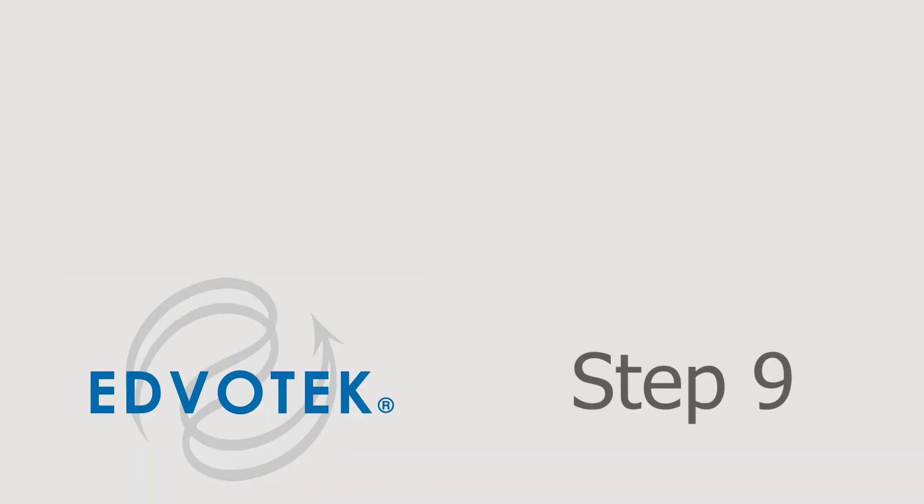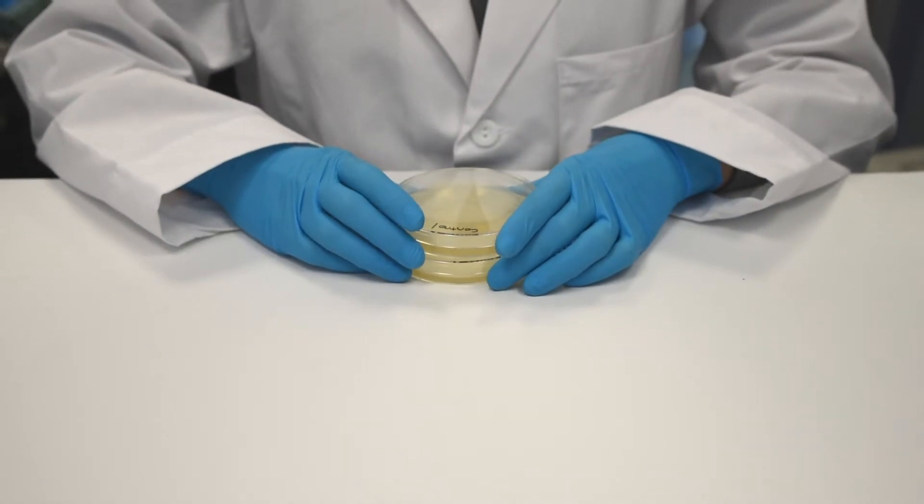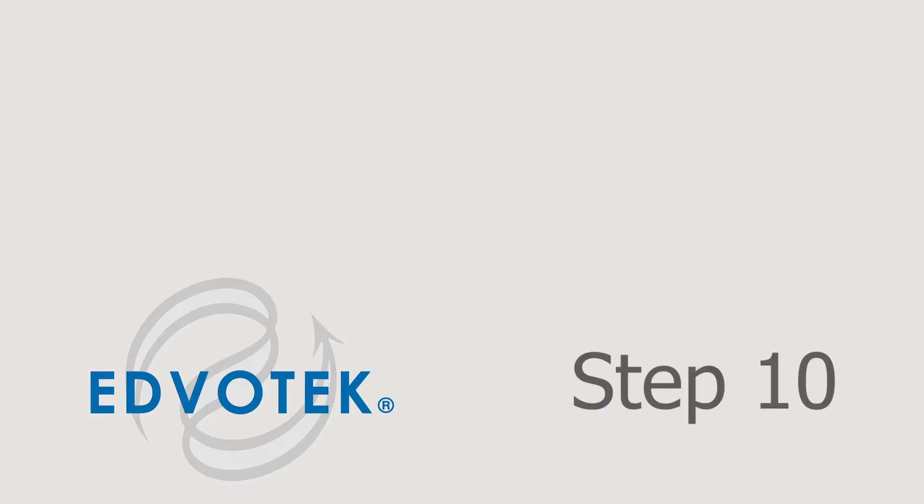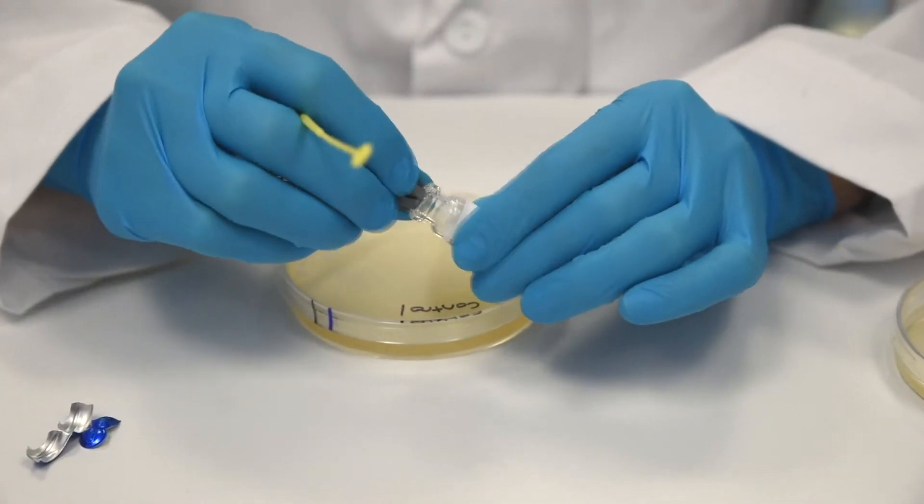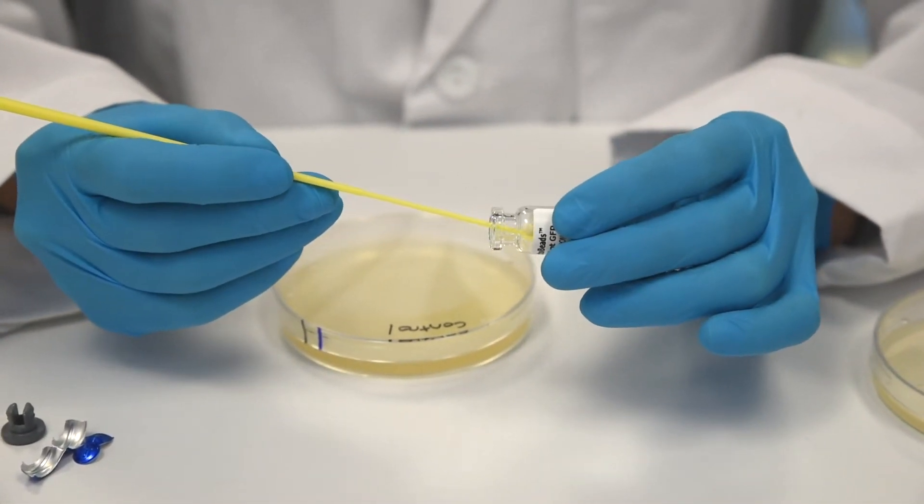Step 9: Retrieve the two large LB-Amp IPTG control plates. Step 10: Repeat steps 1 through 7 using the E. coli PT-GFP Bacto beads.